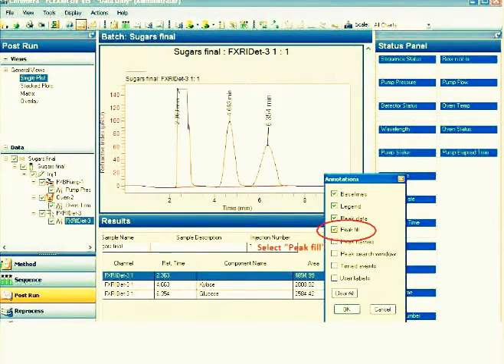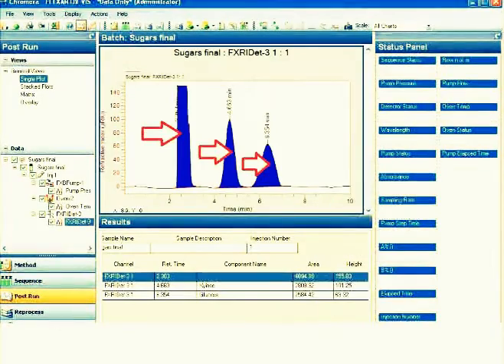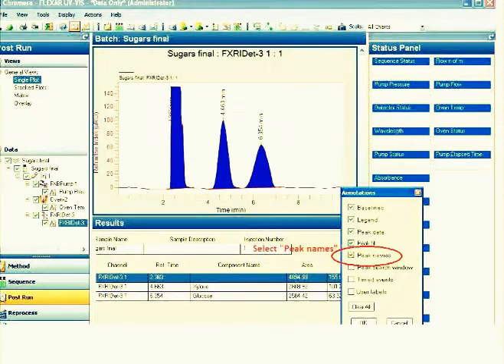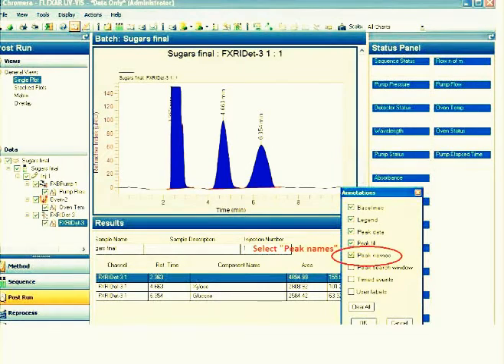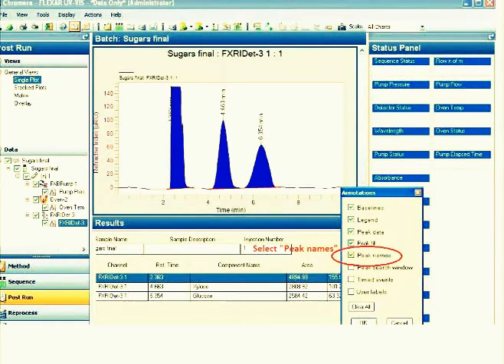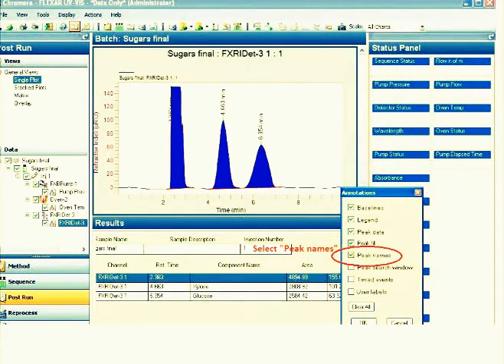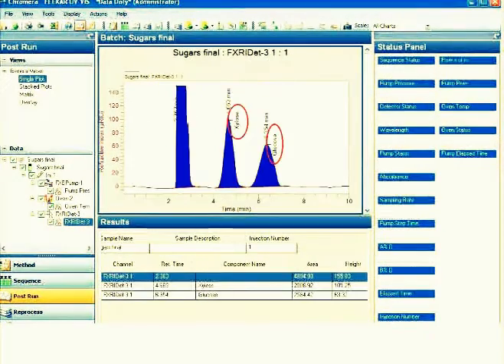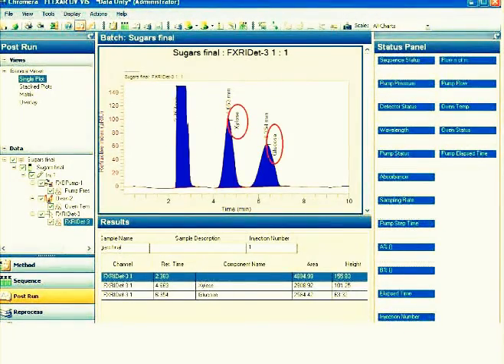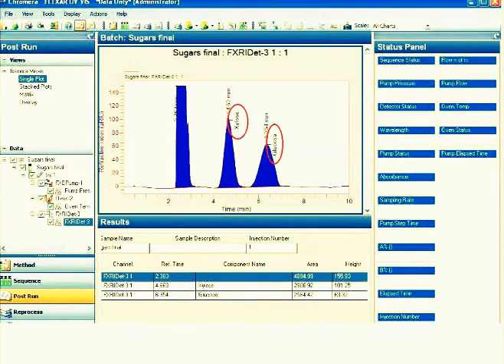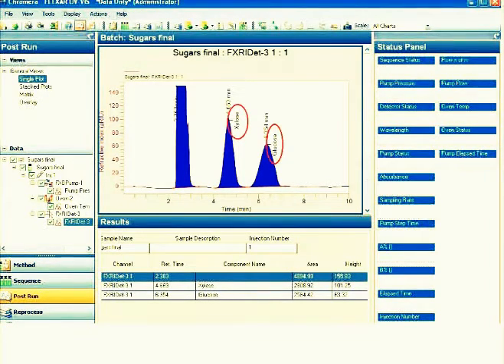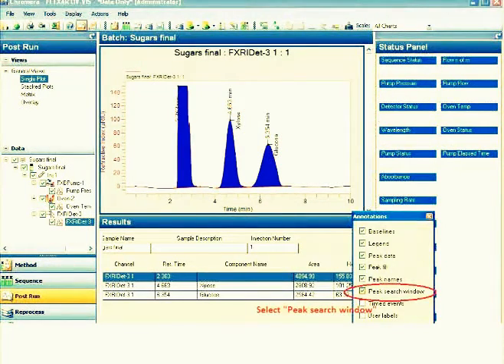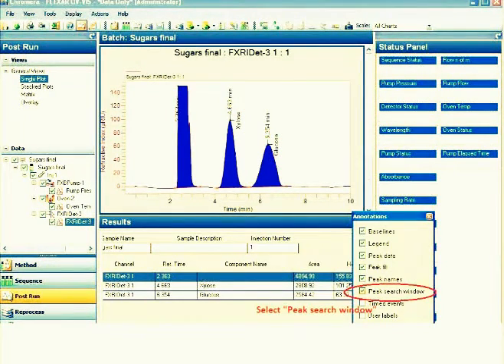By clicking peak fill, it will be filled by a color. Then peak names - automatically, if you load this data, the peak will be labeled accordingly. The first peak is your solvent. This is a sugar, so second will be xylose and the next will be glucose.